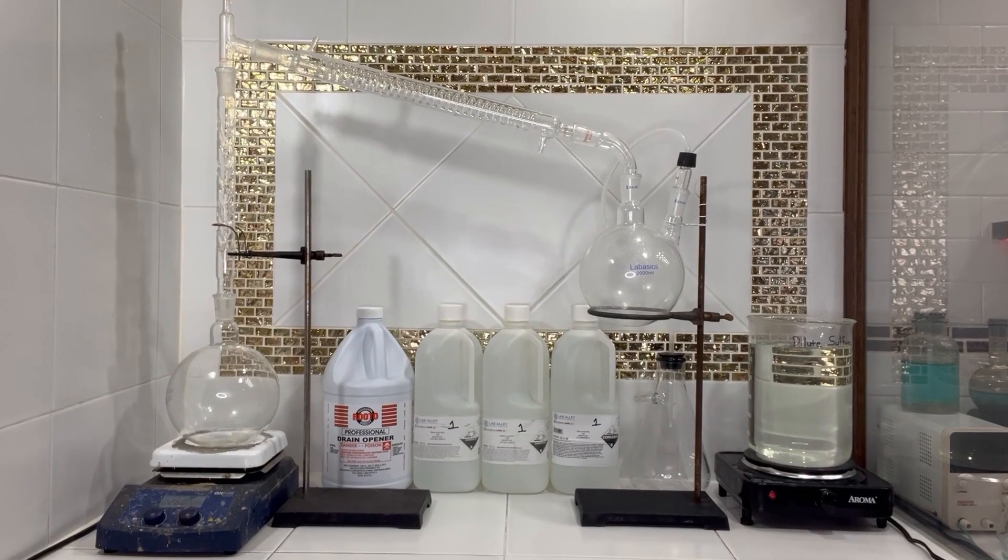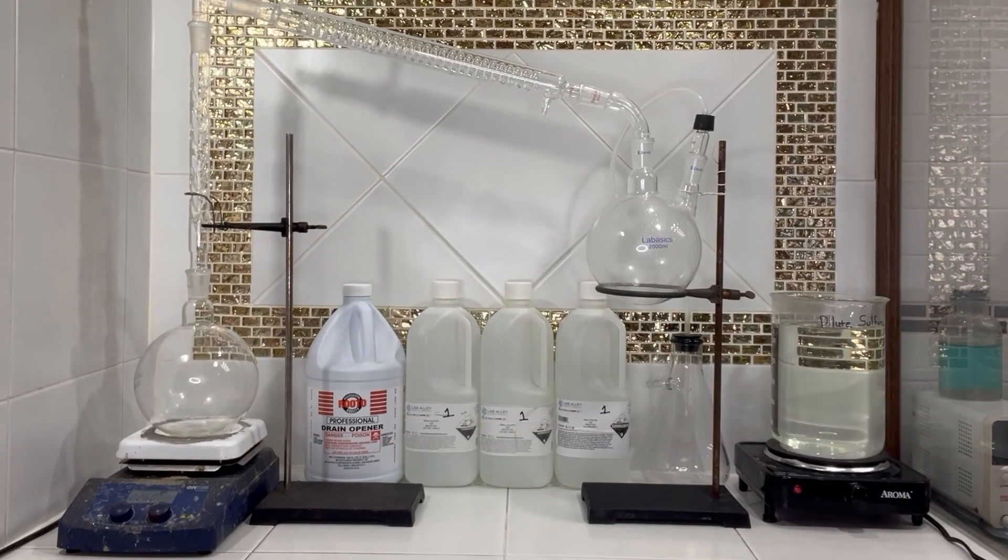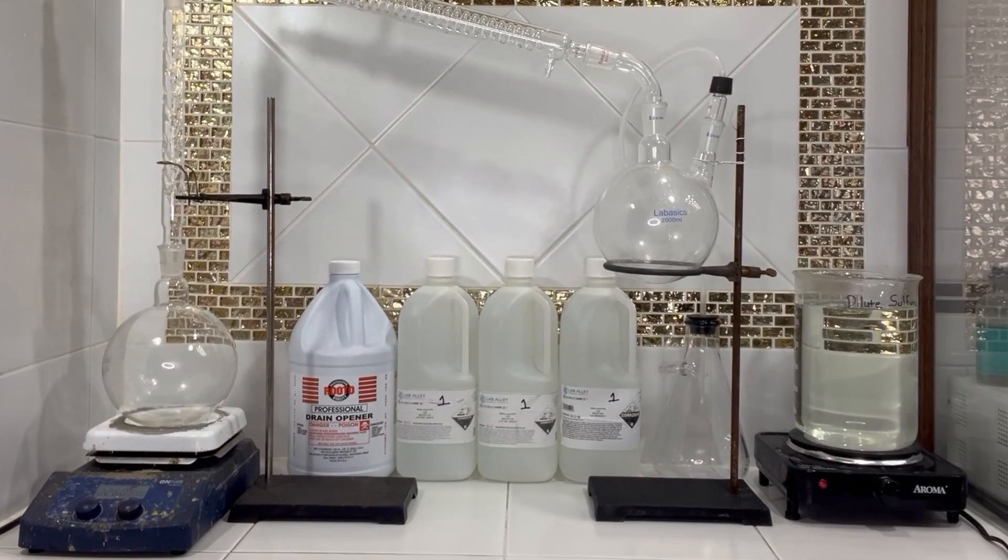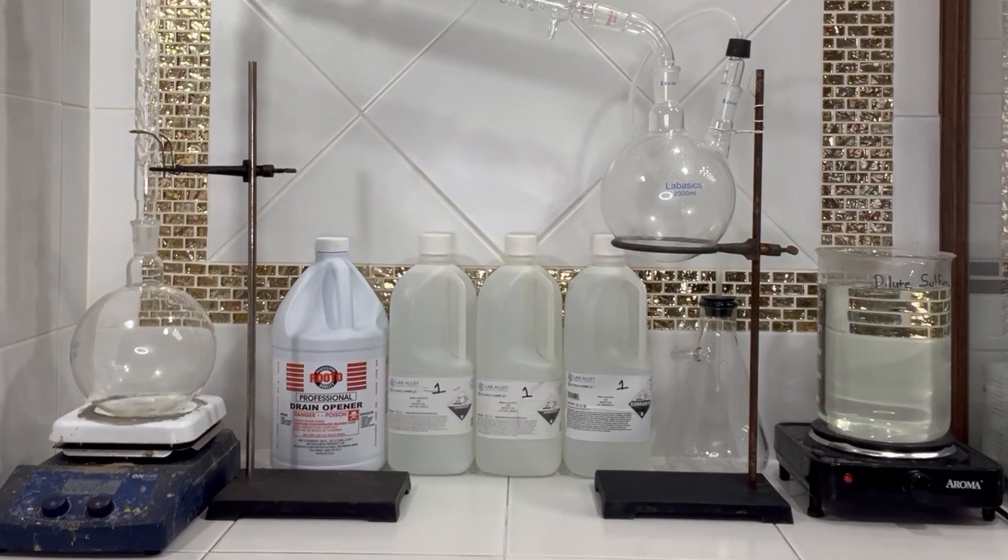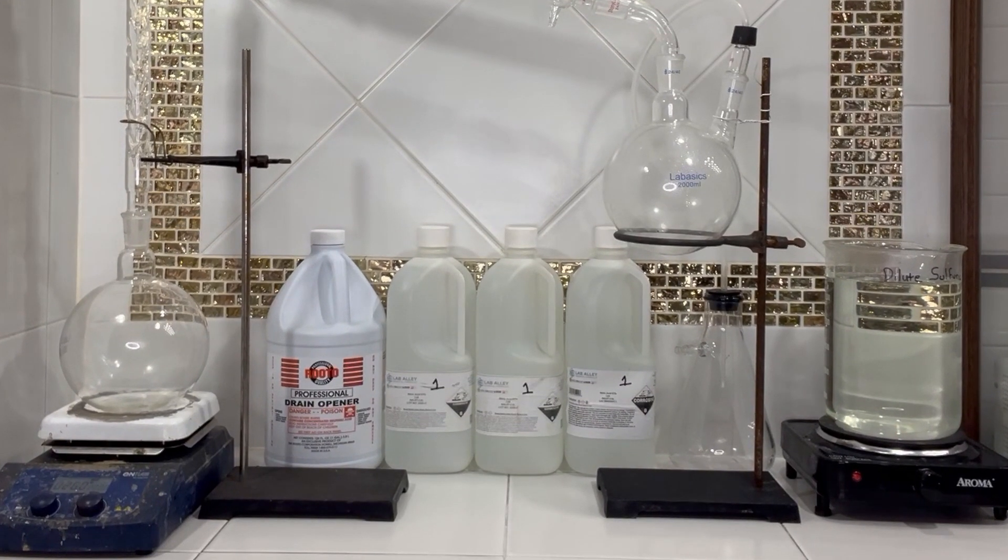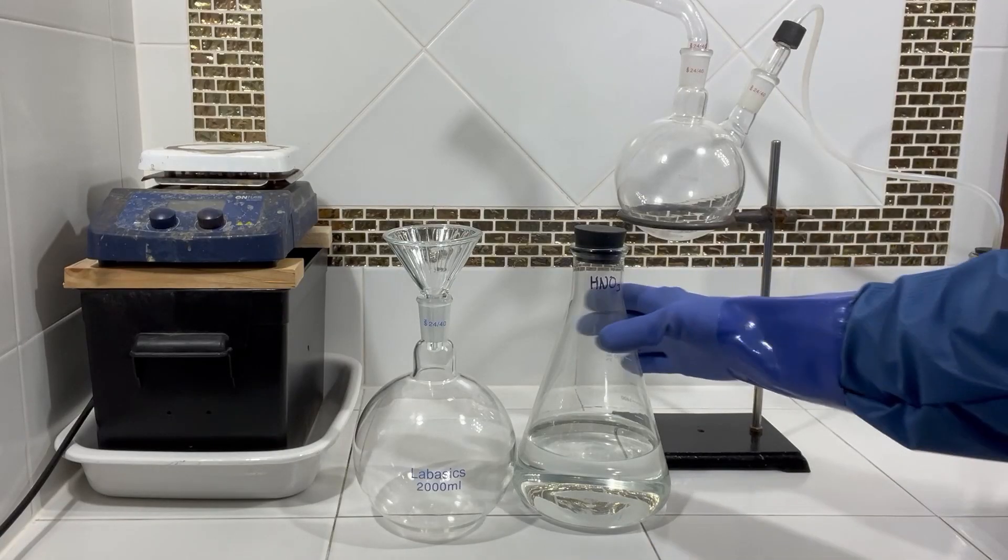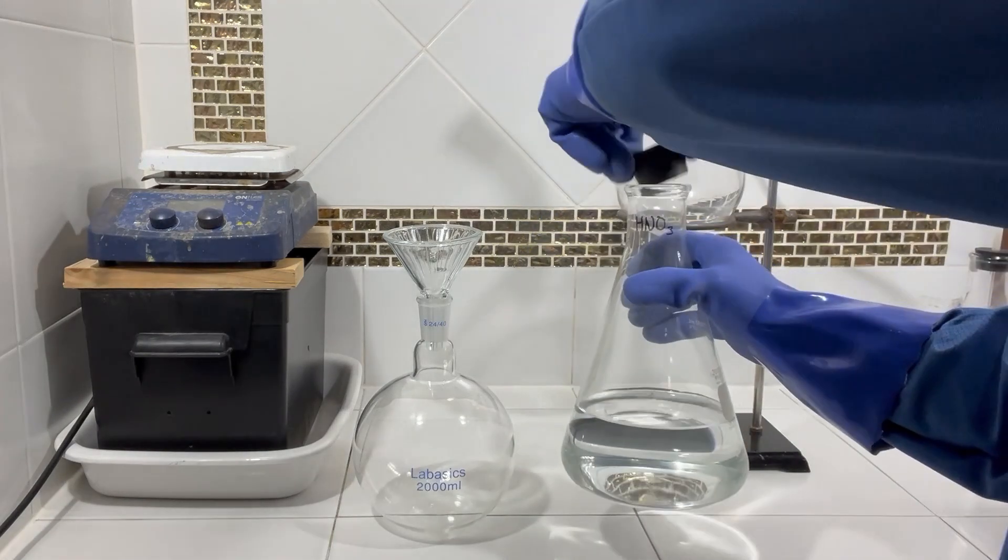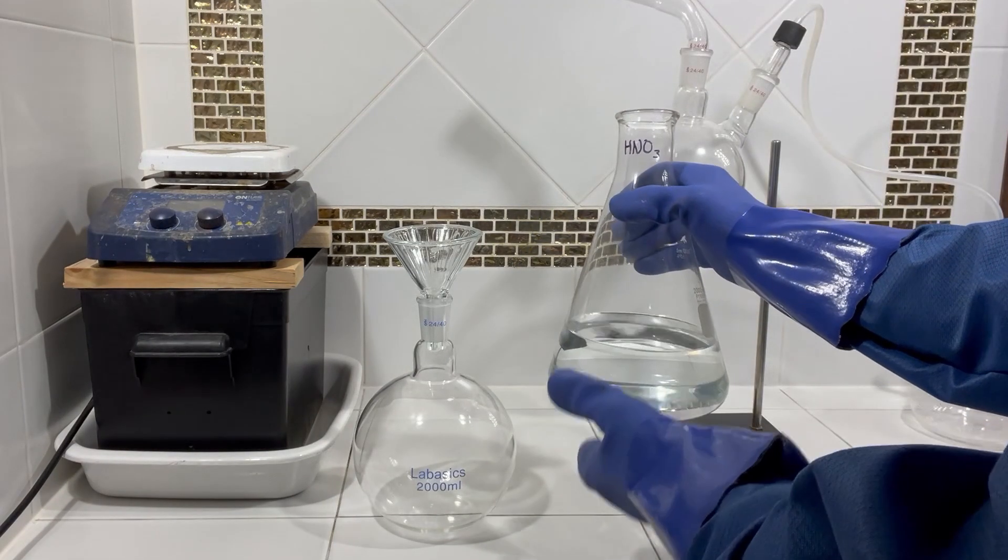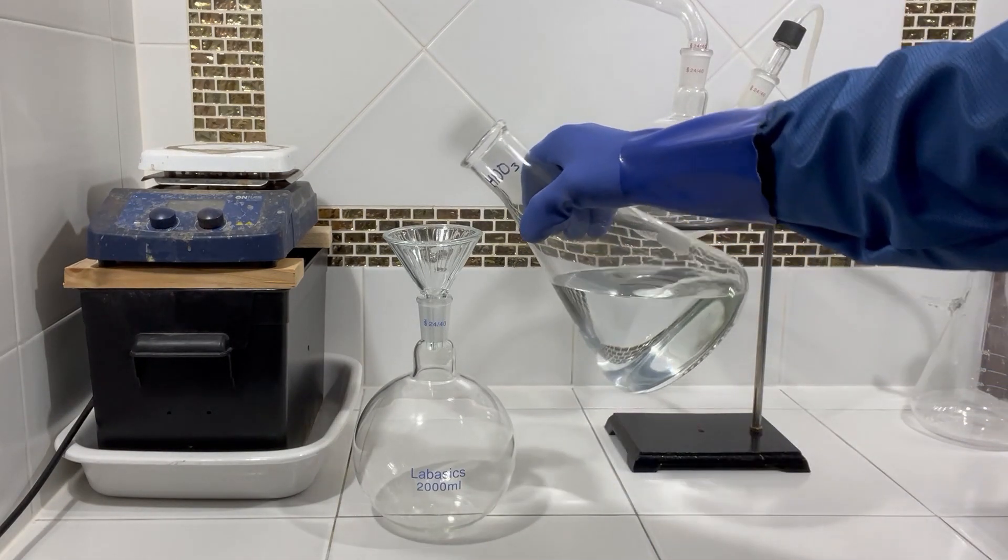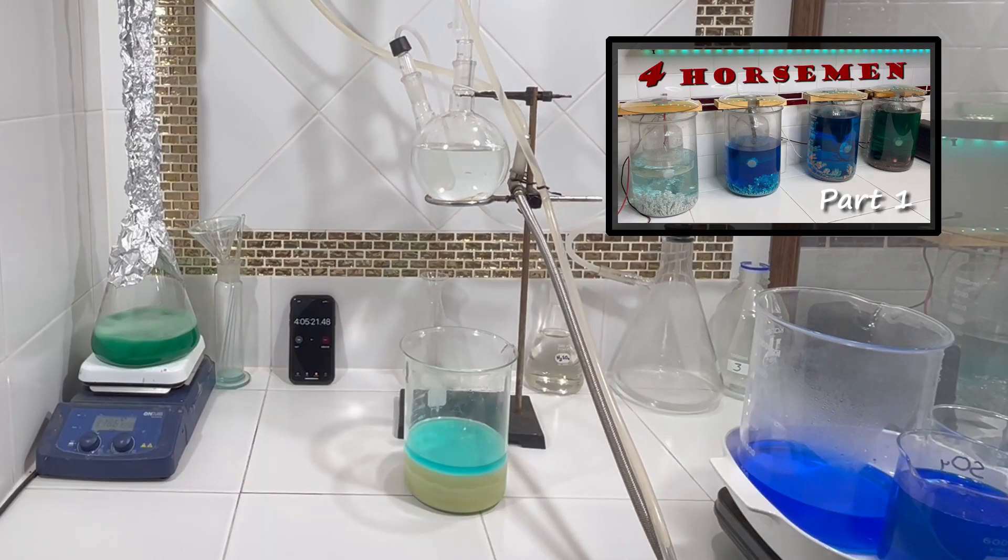The total amount of distillate that I collected from five gallons of copper nitrate was just over 7.5 liters, and I'm referring to this as nitric water at this point because I'm not quite sure how much nitric is in there and I know there's still quite a bit of water based on the way that I distilled it off in the last video.